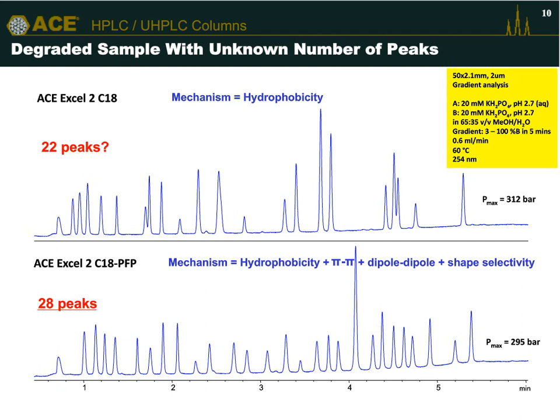And what I'm showing on the screen is a very simple screening approach, and sometimes you find these set up in laboratories all around the world where people have 2 or 3 or 4 different columns with different selectivities or bonded phases, and it helps them understand different elution orders, different compositions of the samples. It helps them understand what is in these samples. And then by peak tracking, hopefully we can see everything that's in that sample. So stationary phase selectivity is very powerful. We're using the power of selectivity through the stationary phase.